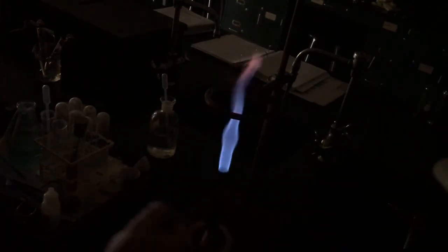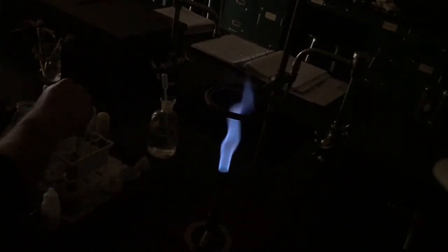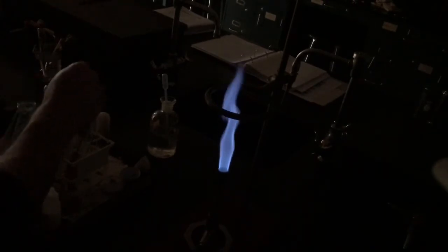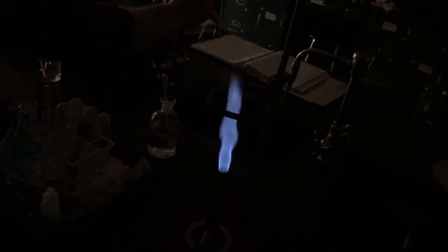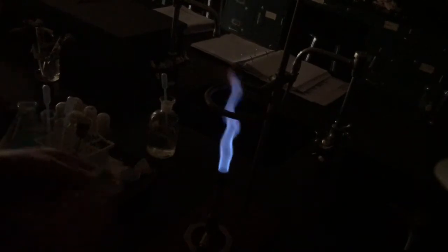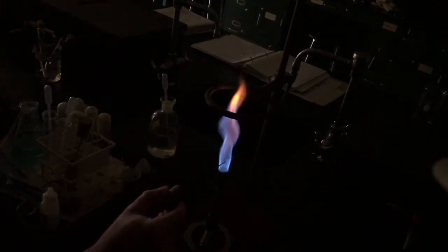Okay, so the next one we're going to look at is calcium. Our calcium ion will look like that.